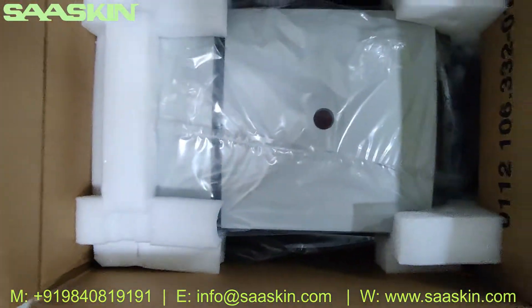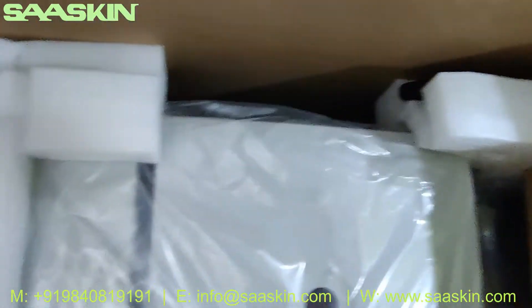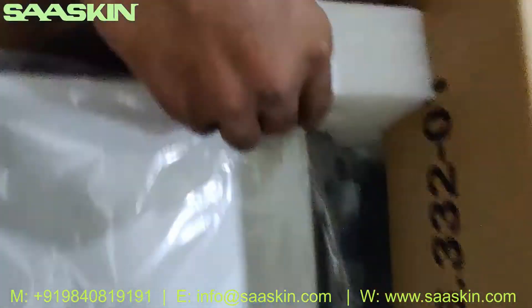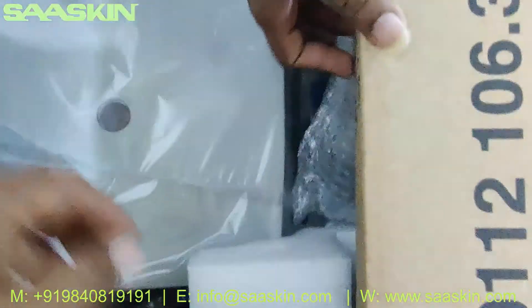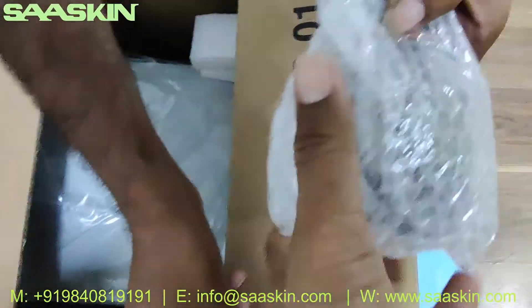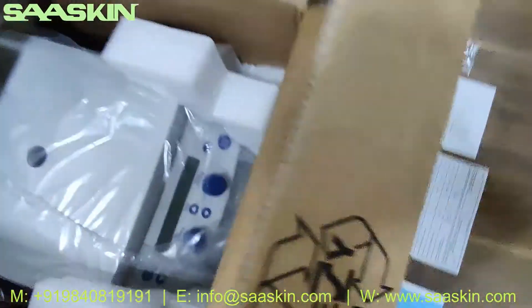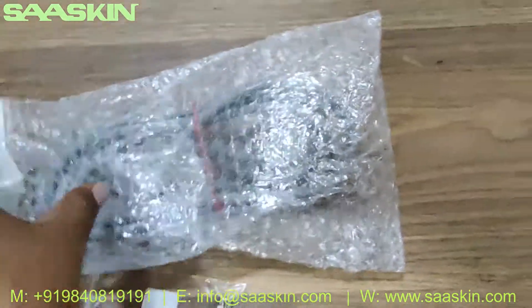If you look at how the packing is done, it's very nicely and safely packed. You can see what is inside. Let me go through them one by one. Okay, you've got a power cord and adapter — here's the power cord and adapter.